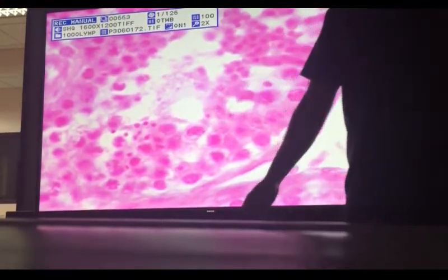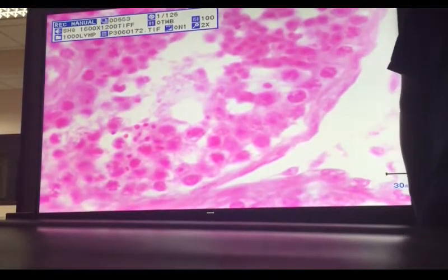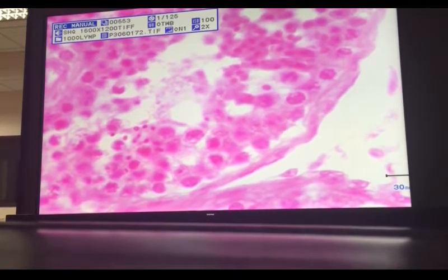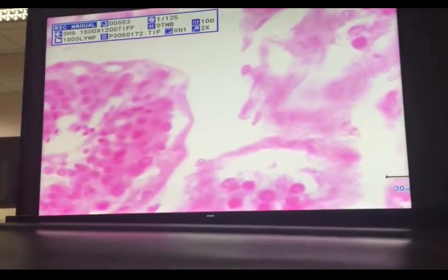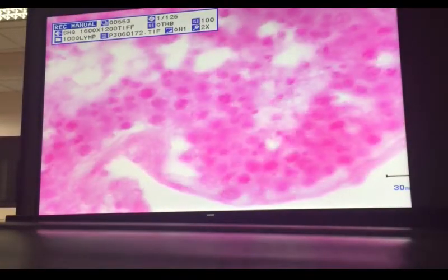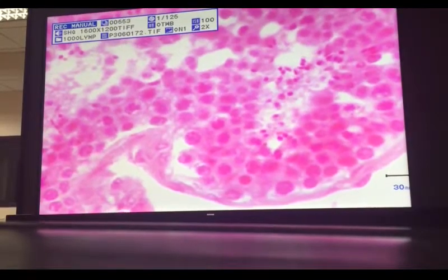How will you be able to differentiate a tailed spermatid from a mature spermatozoon? In the last stages of development of the spermatids, they will already possess the midpiece and the flagellum. How will you be able to know that a flagellated cell is still a spermatid and not yet a mature spermatozoon?